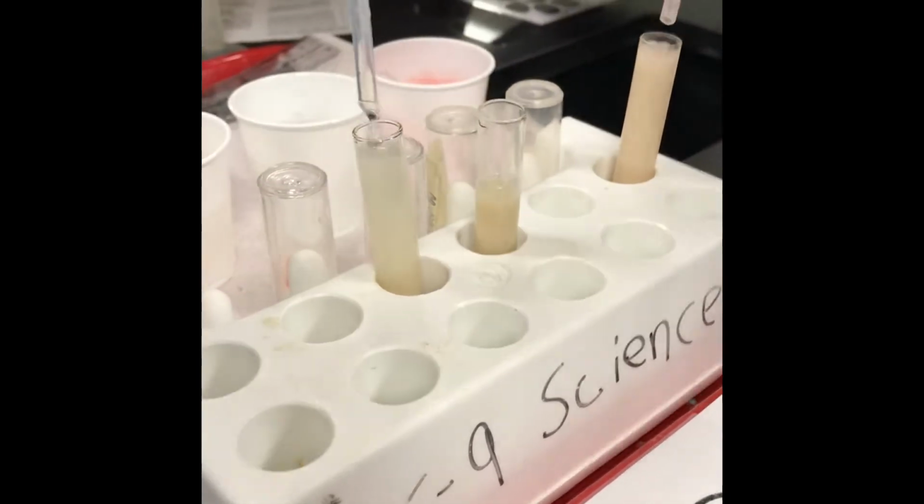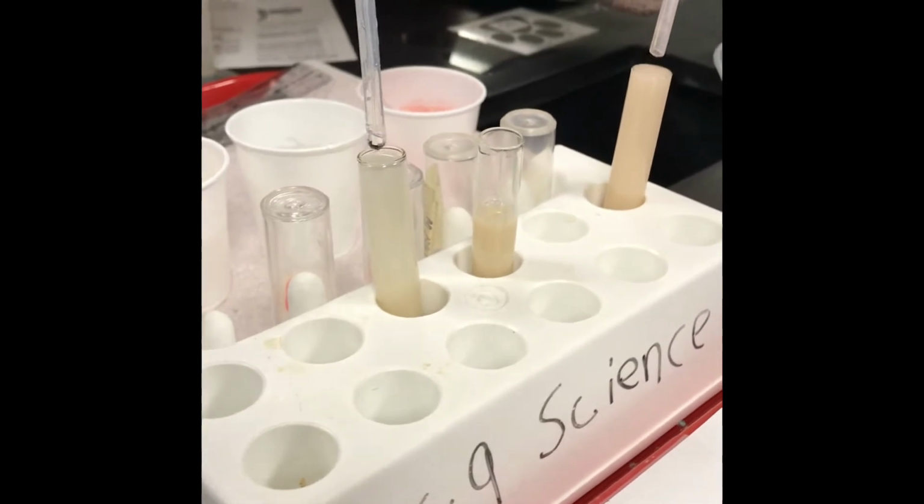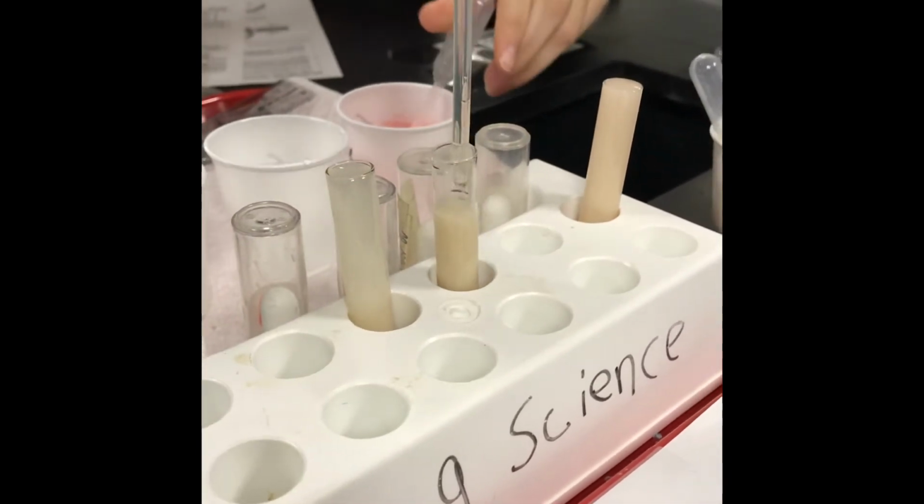You have to give them a food source, y'all. They have to have some food to perform fermentation. Remember, they have to go through glycolysis. Tasty water.